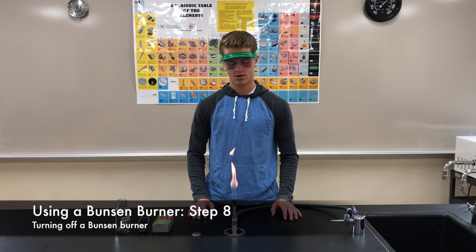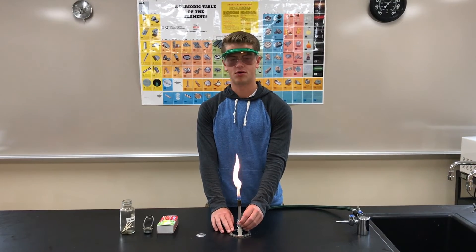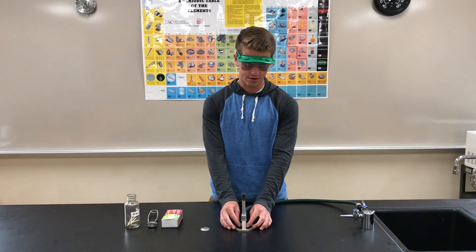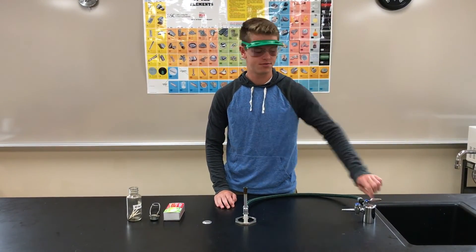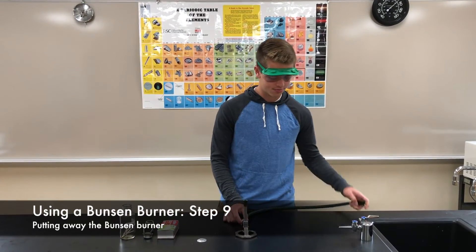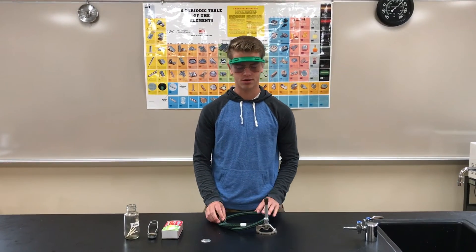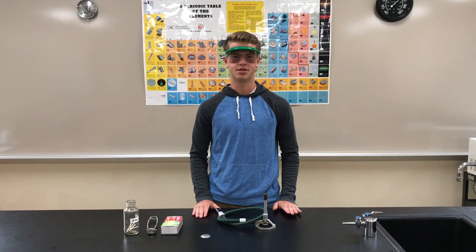To turn off the Bunsen burner, screw the barrel until it is tight — the flame should turn orange or yellow. Then screw the valve underneath until the flame dies down and stops. Then turn off the gas and disconnect the hose from the gas line. Tie it like a pretzel so that it stays secure. Be careful not to touch the barrel because it is likely still hot.